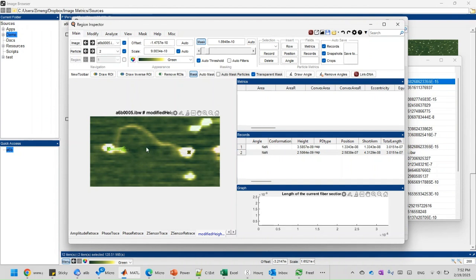And so we want to separate them out, right? This is not exactly great quality angle measurement. So instead of adding to my angle one, which I would prefer to be my highest quality angle measurement, we can simply add a different column of angles. Let's say we can add two columns of angle. For this column, this is angle one, that's our best quality angle measurement. That way I can add another angle measurement. Let's right click that, because we just added two columns. I will say add to angle 2.